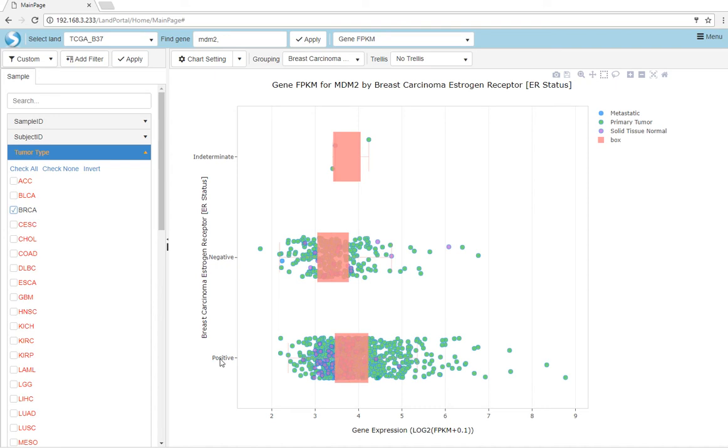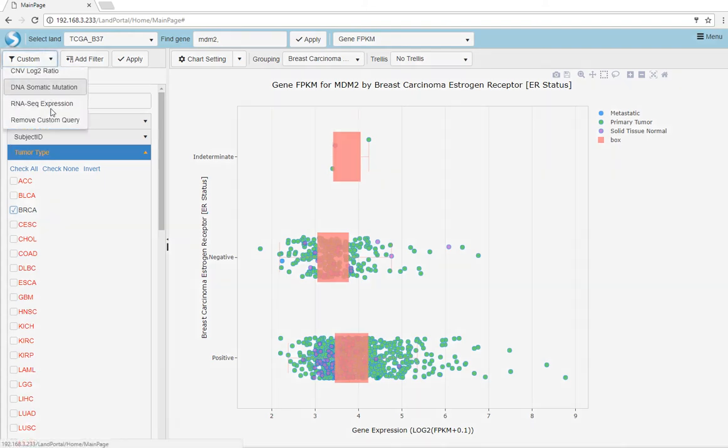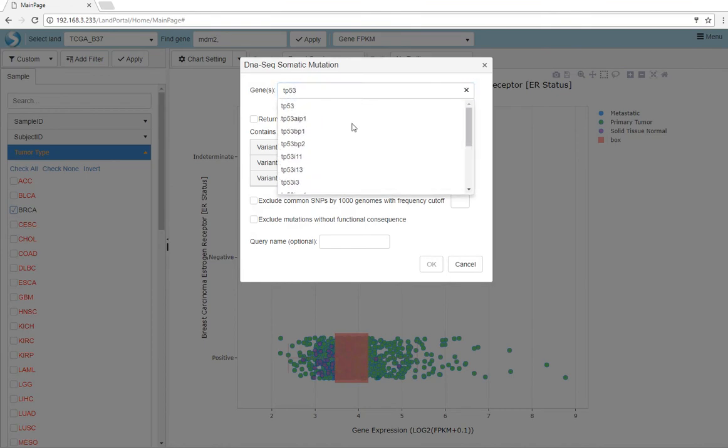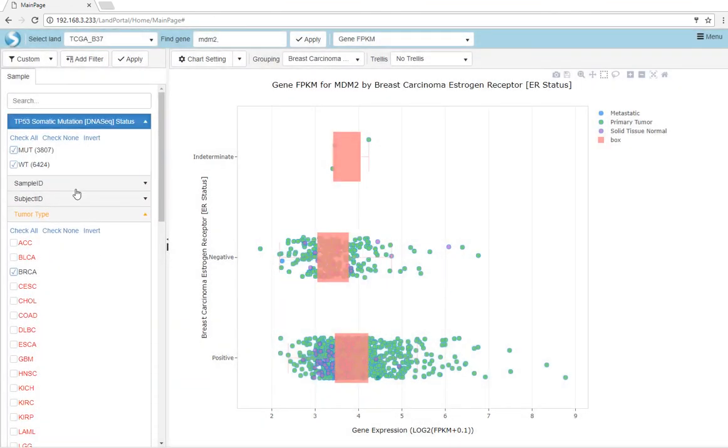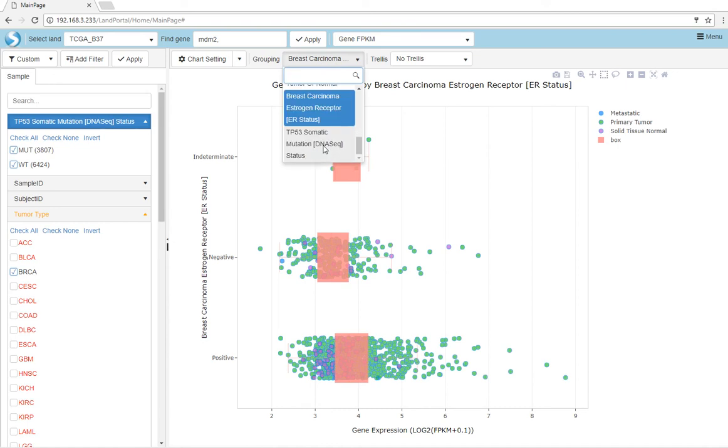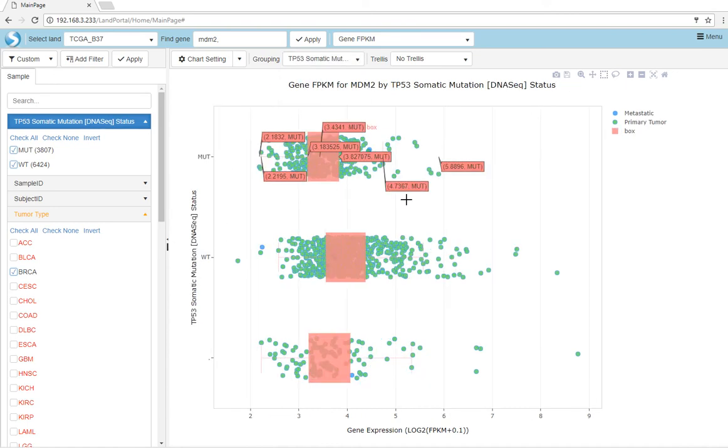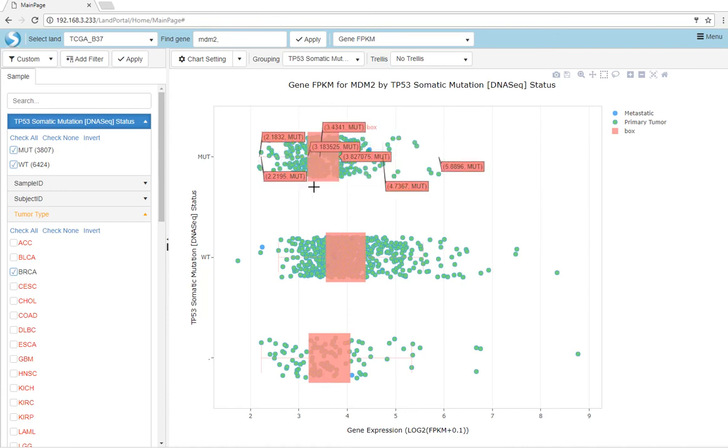In addition to grouping by clinical metadata, we can also add custom queries in the portal. For example, we can query mutation status of TP53. This query will be added to the filters on the left side of the screen. We can further use this filter to group our expression view. We can see that TP53 mutations lead to lower expression in MDM2.